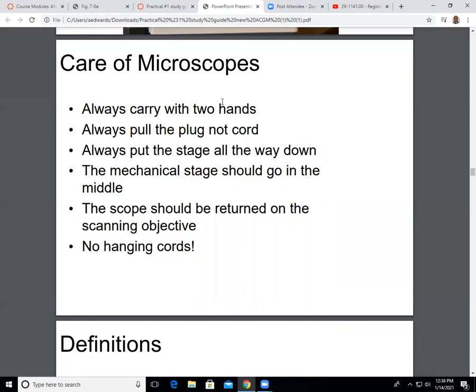All right, so I'm gonna wiggle this piece right here. Can anybody see that? This is stage clips, right? And then the slide or stage adjustment knobs down here, just to give you a better view. Okay, move the slide around. All right. So down here, can anybody see this right here? Yes, the diaphragm, and then up here is the condenser. Okay. All right. Y'all got it.